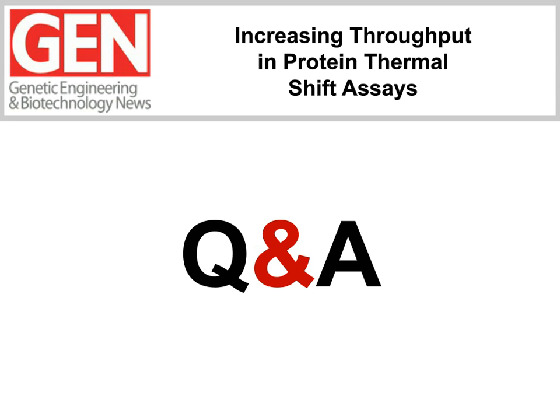So one of our audience members also would like to know, they had said, it sounded like you said 2 microliters is the maximum volume in the 1536 format. Don't you mean minimum volume? What volume was used for the 1536 data? The 1536 data that we showed on the slides, that would be the 2 microliter volume, and 2 microliters is the max volume, not the minimum volume.